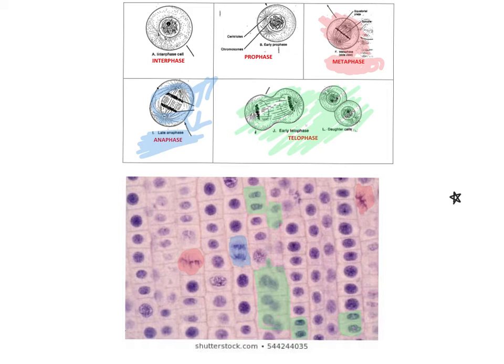Then, continuing on, I'm going to color prophase. For prophase, I'm going to look for all of the cells that seem to have a pile of spaghetti in the center, meaning it's not all the same color, it's not all purple, but where I can see what looks like a plate of spaghetti. So I'm going to say that this one looks like prophase, meaning the chromosomes are condensed, and hence they look a little bit darker. So anything that's not a solid blob in the center is what I'm coloring. Maybe this one. And you are, like I said, going to make some calls about what you want to specifically define as what. If you get a few cells wrong, it's not a big deal.